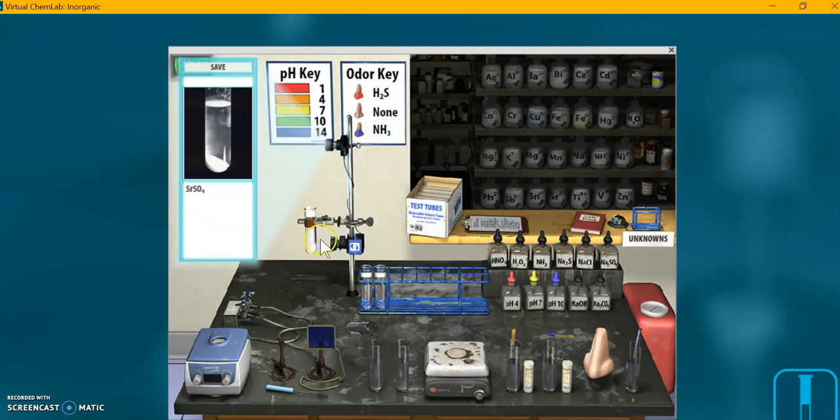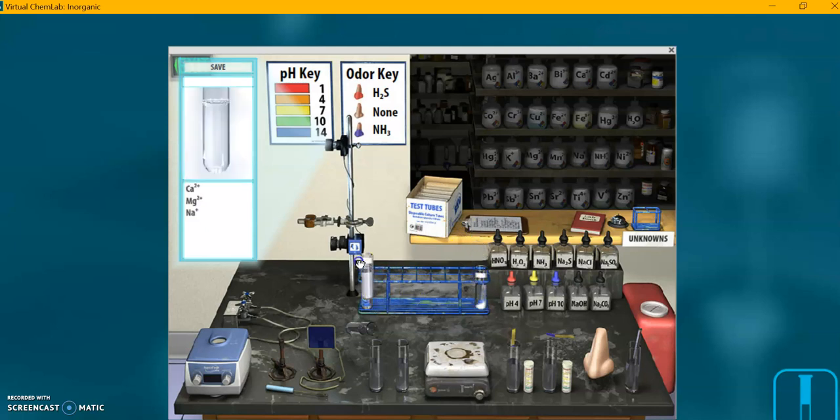And again, it appears there. I'm going to move that out of the way. That's just my strontium precipitate. I'm going to put that back on there. No, we still have the original that I divided earlier, the original. We're not using that now. We've removed barium and strontium now.